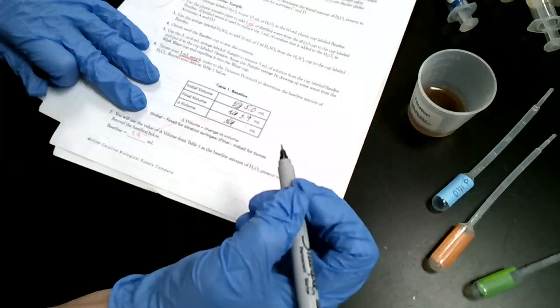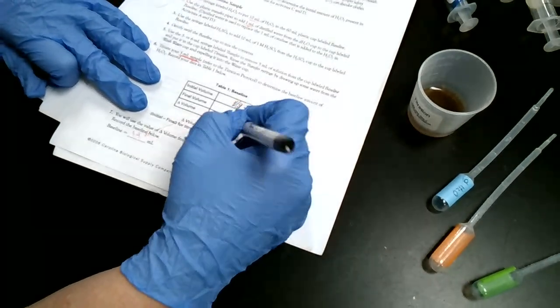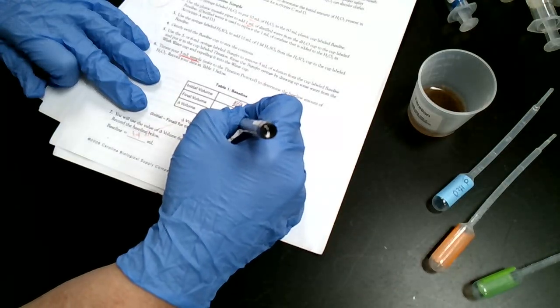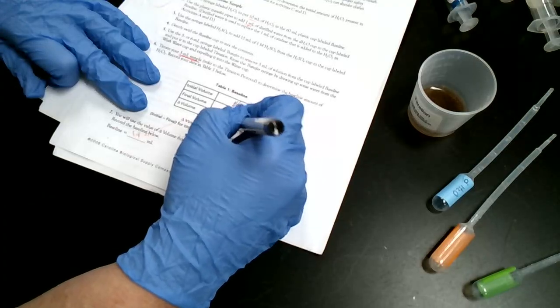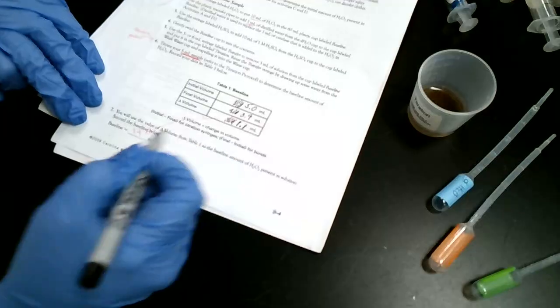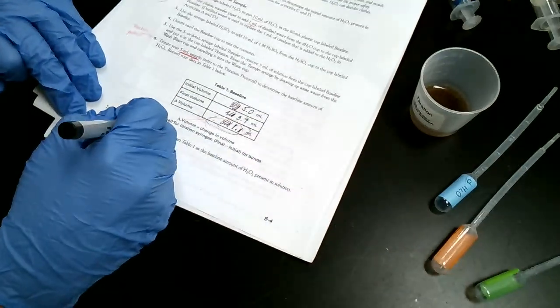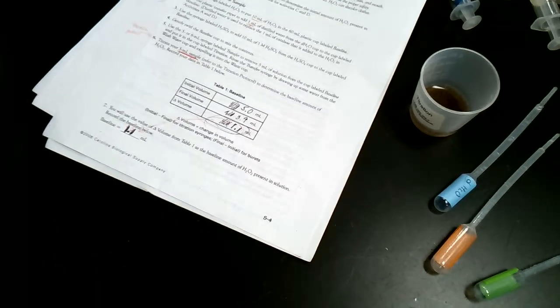So through the math, okay, I come up with, I believe, yes, 1.1. Am I right? 1.1 milliliters. Okay, 1.1 milliliters is my change in volume. So my baseline, this number here, I'm going to put down here is my 1.1 milliliters.